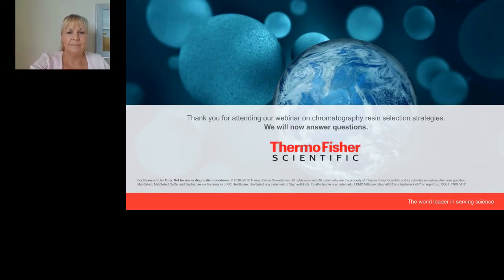It's for Scott. Scott, can magnetic agarose beads be used for immunoprecipitation or co-IP experiments?